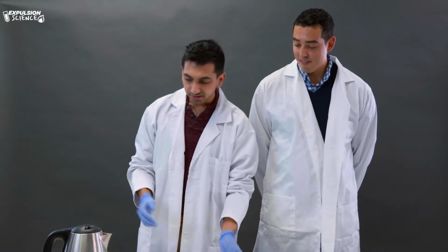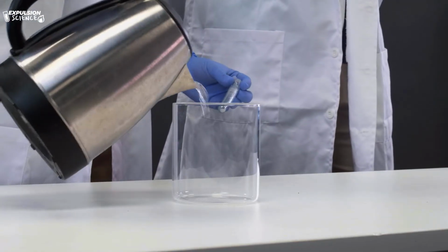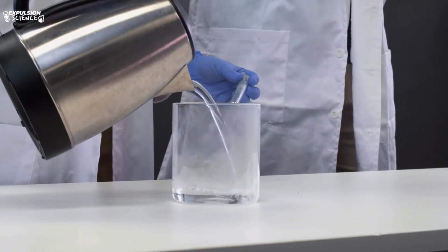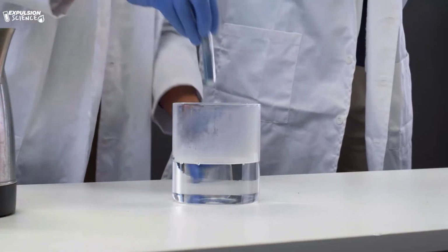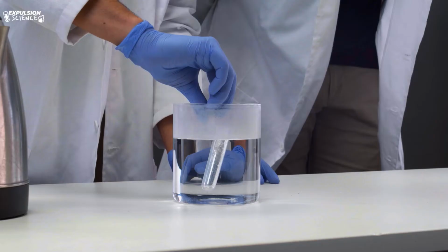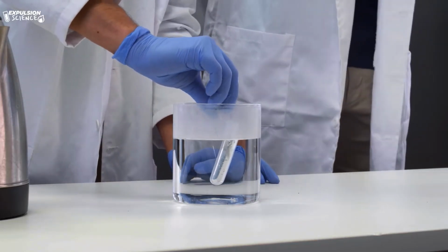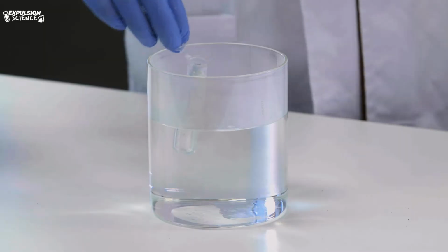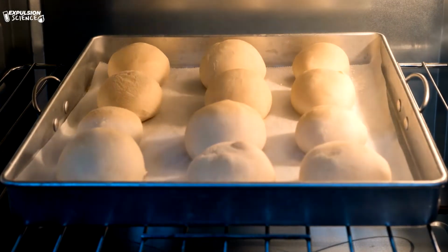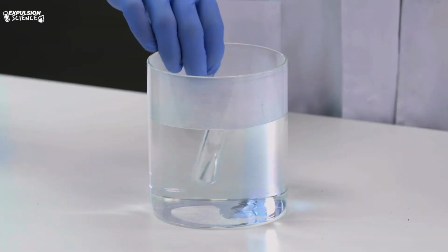And so what we're gonna do is we're gonna just take a pot of hot water. We're gonna go ahead and pour ourselves a pot of hot water. There we go. And we're gonna go ahead and melt our gallium. The reason I'm melting it like this is because whenever you have hot air inside of a glass tube, it will expand. So we wanna make sure that our glass doesn't break. Any element that gets heated up is going to expand. Even the glass right now is expanding as we heat it up.